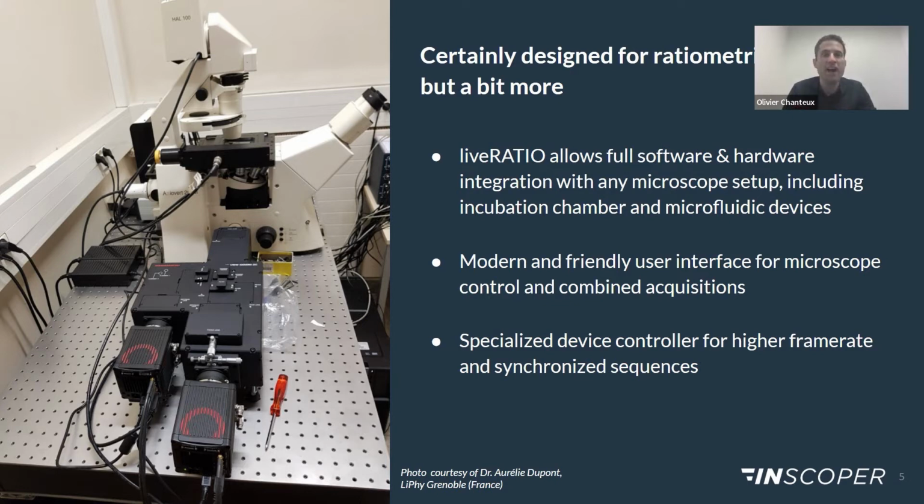It can be installed on a shared microscope to address various imaging needs. This is, of course, an adequate solution to upgrade or renew an aging microscope, but it is also well fitted to build and customize a new system with ratiometric capabilities.